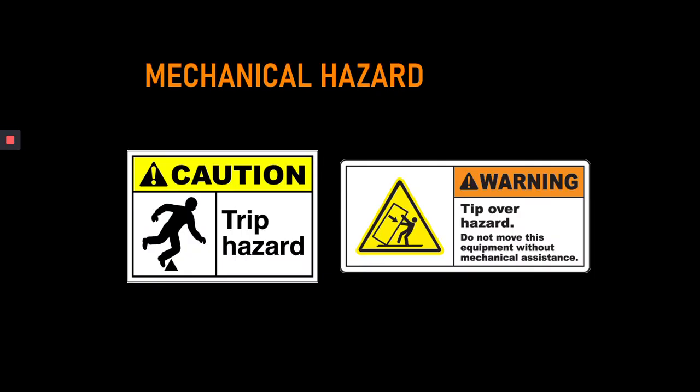Okay, for the mechanical hazard, you have here two illustrations. We can see that mechanical hazards are like trip hazards or tip over hazards. So do not move this equipment without mechanical assistance. So these are examples of mechanical hazard. Okay.